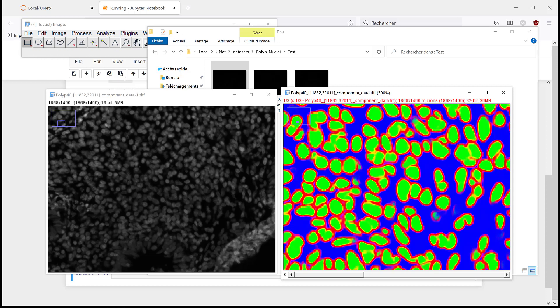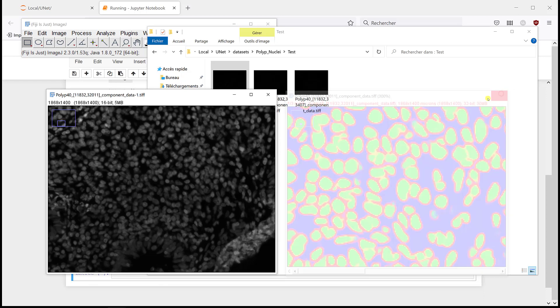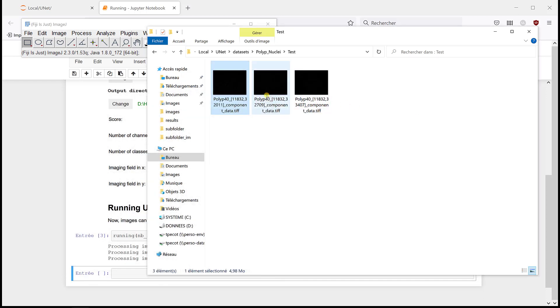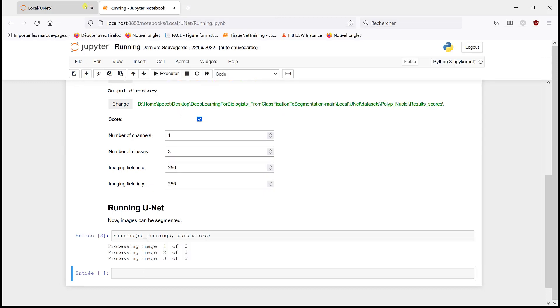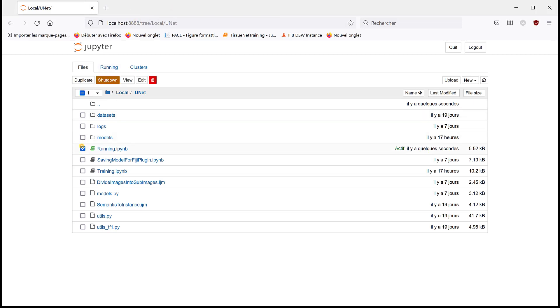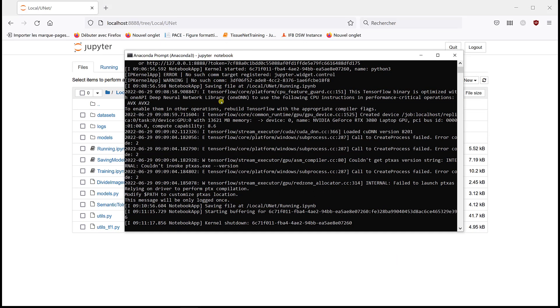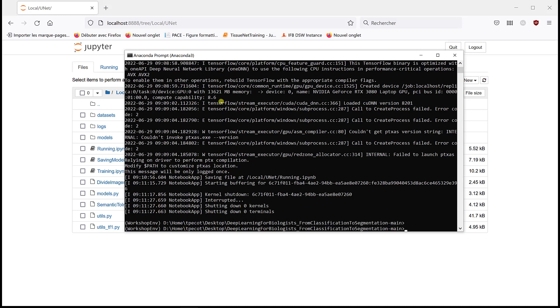So there's the ImageJ macro to do the post-processing, which is explained in the course how it works. But before that, I'm going to first save the model to be run in Fiji. So I'm going to close this, shut it down, and I'm going to kill it from here. So I do Ctrl+C twice, and that kills everything. And I'm going to use the virtual environment we defined for epithelium and stroma segmentation.